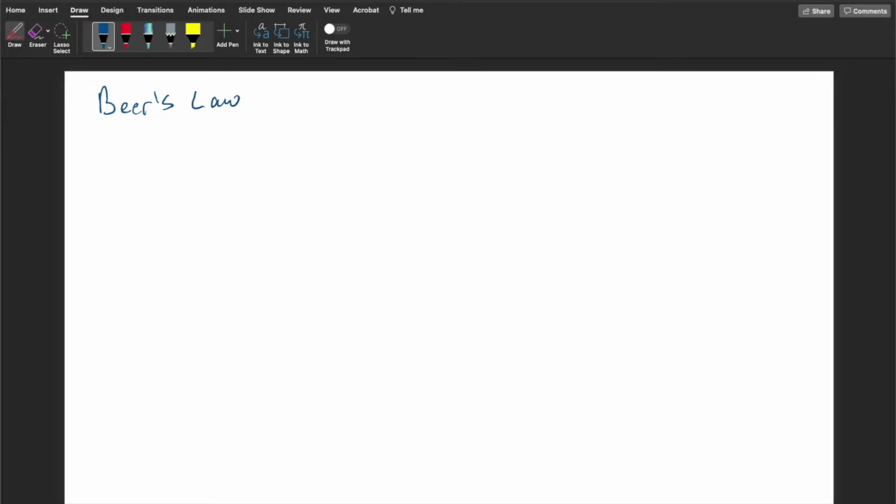Beer's law says that the absorbance equals B E C, okay? And so the absorbance equals BEC, right? Based on the information you have, you have the absorbances already. Those are all the absorbances that you wrote down as the reaction was progressing inside the spec 20, every 30 seconds for 30 minutes straight. And what you're searching for is C, because the C here is the concentration, right?